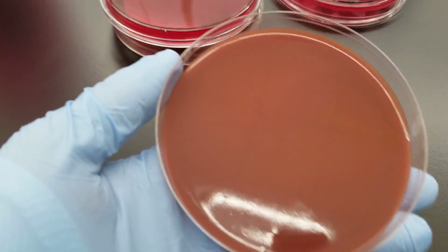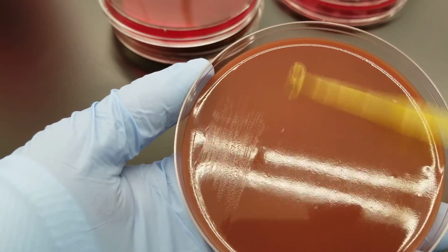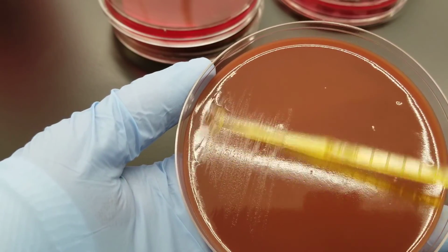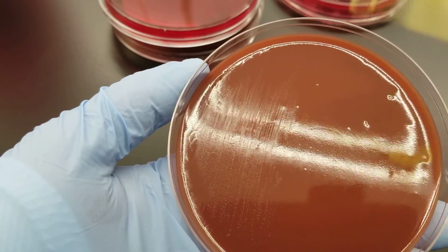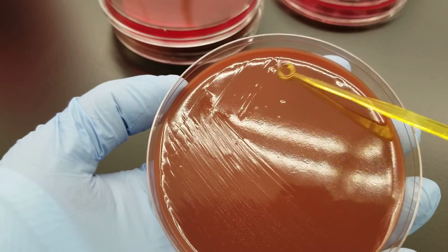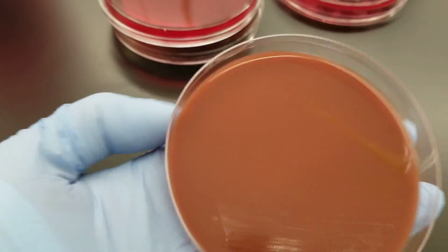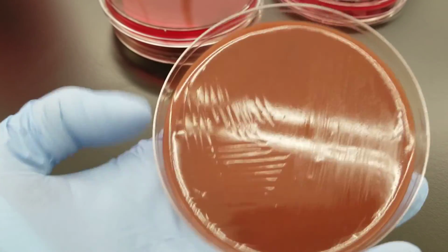I'm going to continue on, and then we will place the discs on after that. I'm only going to do one specimen because that's really all you need to see. We have several unknowns that the students are doing right now, and I'm just going to film one aerotolerance test.